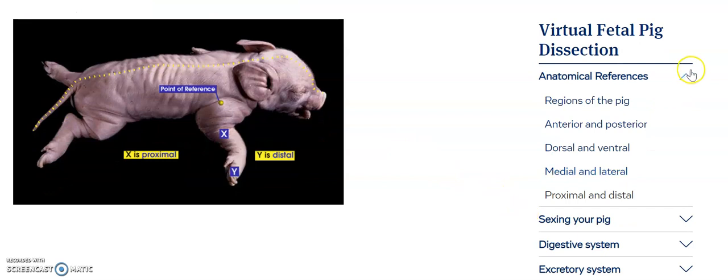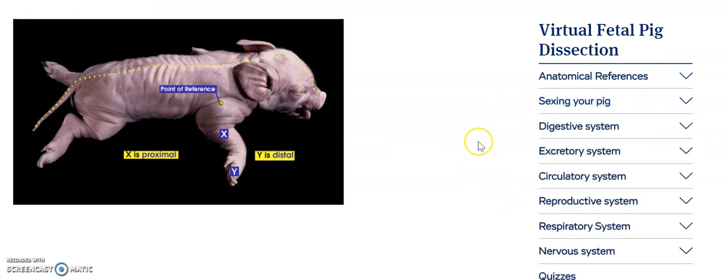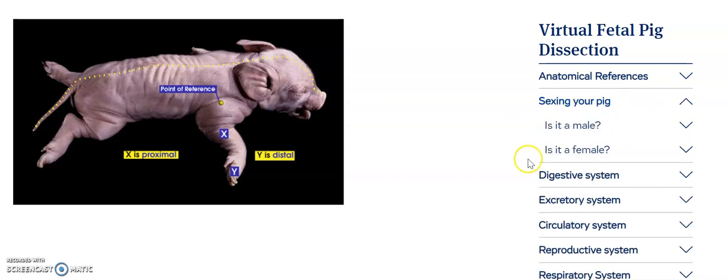Now, we're going to click that up and we're going to go to sexing our pig. This does not mean the joking and nonsensical things that you are thinking right now. It just means, hey, is it male or is it female?